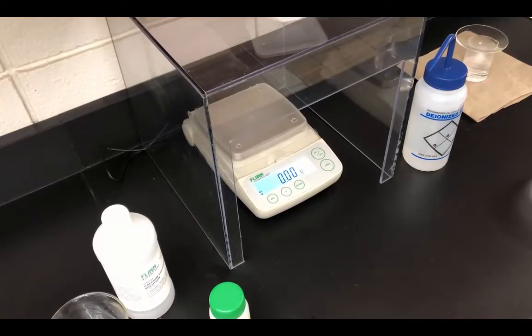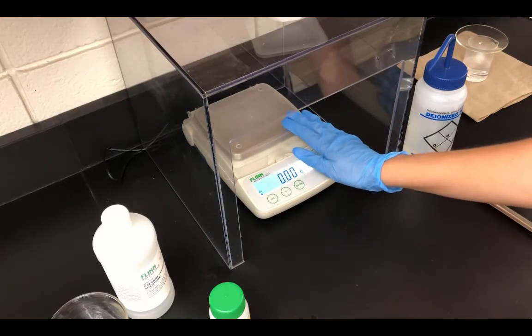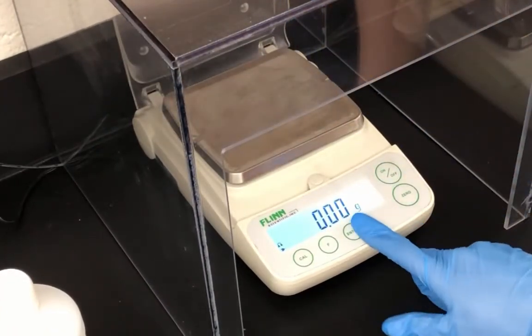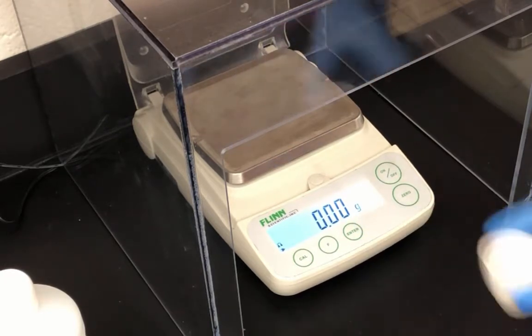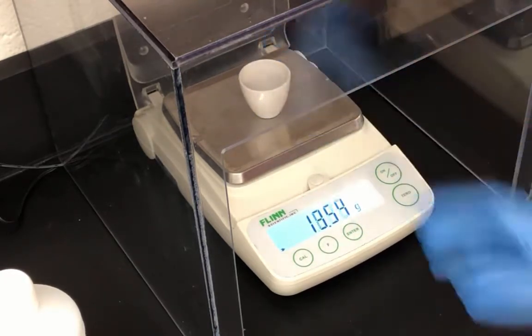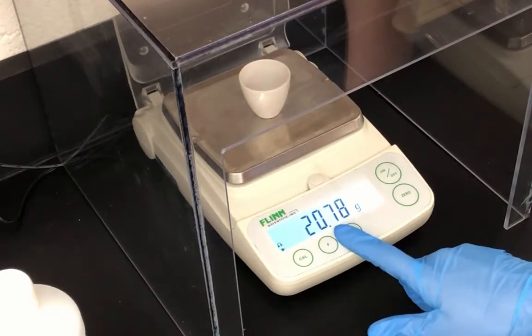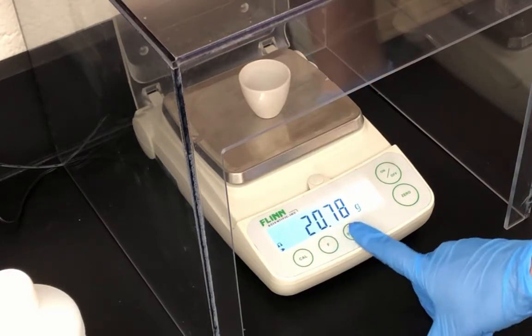Now that the crucible is cool to the touch, I am going to measure the mass of the crucible using our electronic balance. Again, there's a plastic cover on the balance. You want to make sure that that's always lifted up. Make sure that the balance is at 0. If not, you want to hit the 0 button. Then we're going to take the crucible and put it directly onto the scale. The mass of the empty crucible is 20.78 grams.